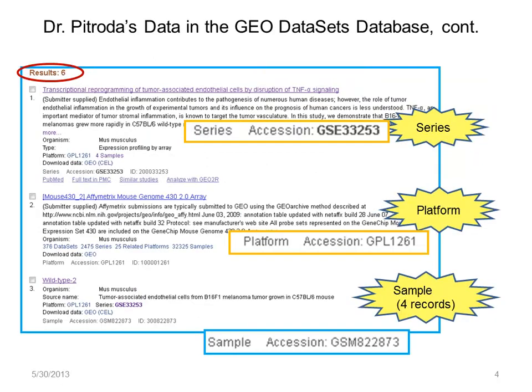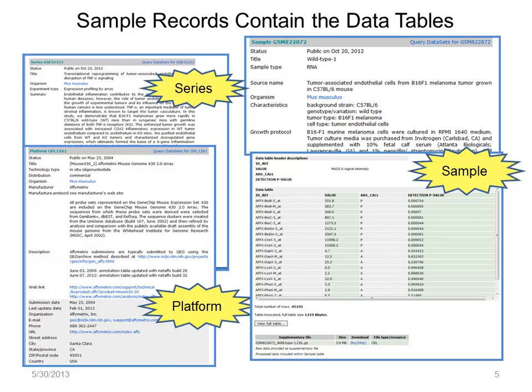Using the GSE accession retrieved six records. One is the series — the description of the study. One is the platform, in this case a commercial array from Affymetrix. And the other four are sample records, though only one is shown here. It is the sample records that contain the data tables.